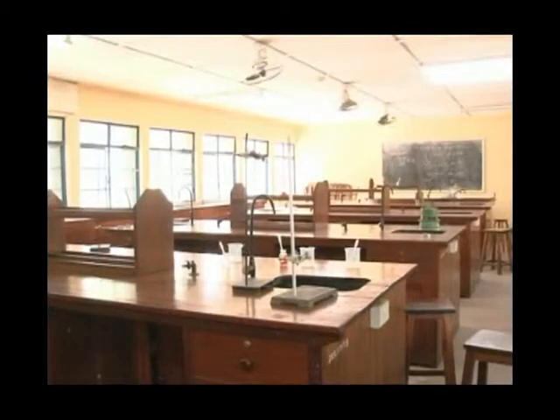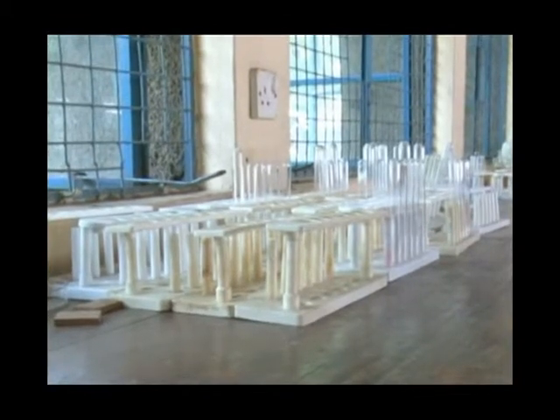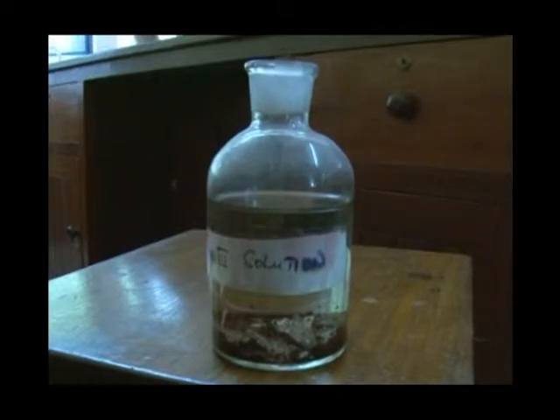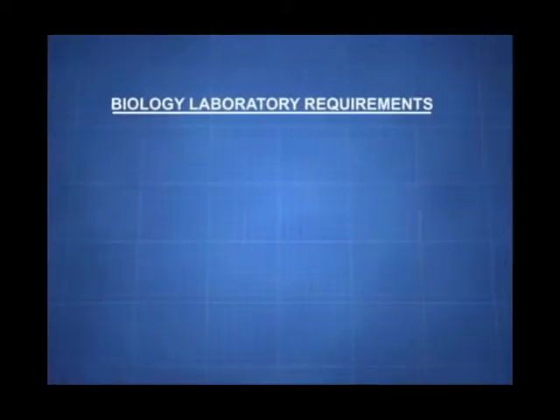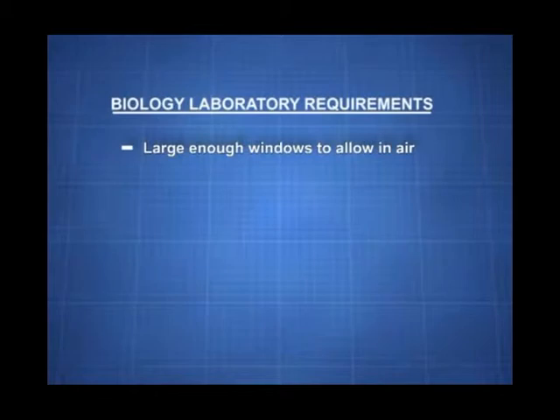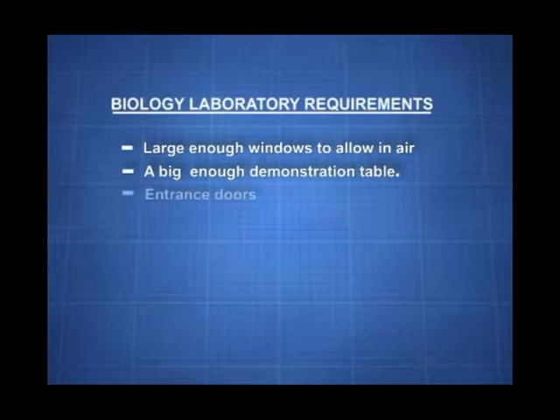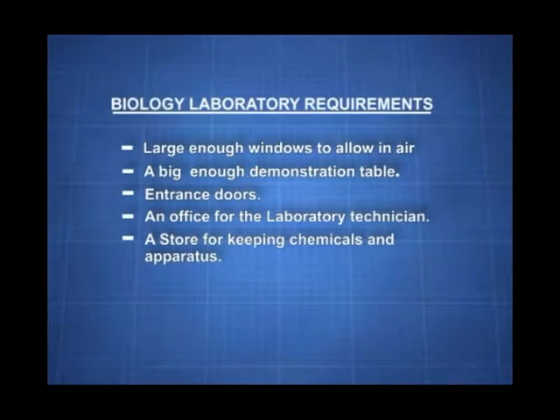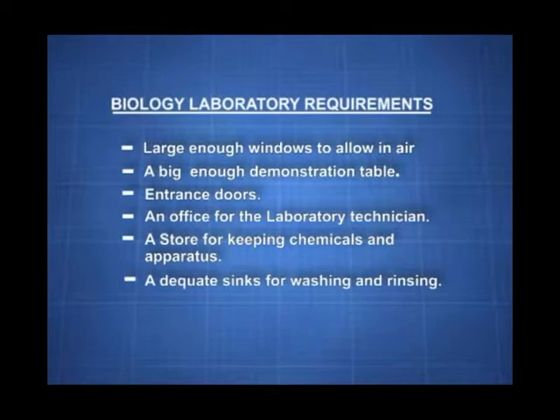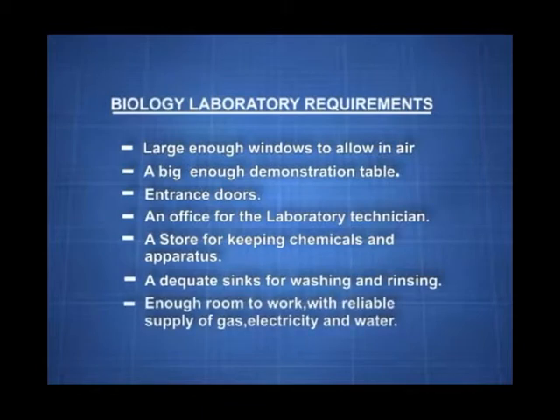Let's sum up what we have learned today about the requirements of laboratories, rules for correct conduct in a biology laboratory, and warnings on containers with chemicals and laboratory apparatus. A biology laboratory should have large enough windows to allow in air, a big demonstration table, entrance doors ensuring easy access and exit, an office for the laboratory technician, a store for safe keeping of chemicals and apparatus, adequate sinks for washing, and enough room to work with a reliable supply of gas, electricity, and water.